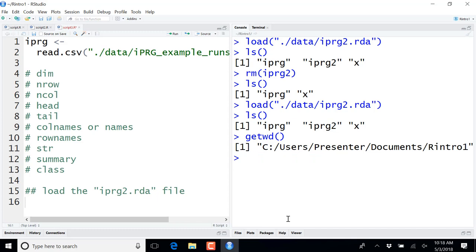So who knows what is stored in this IPRG2? Can anyone describe what I have in our IPRG2? Yes? I guess examples are mass spectrums. So like 12 is total, I guess 4, and each has like 3 replicas, for example. So that's a list of proteins that I guess is 2,000 or so rows long, and each sample or run has a measurement for each row. Yes. Absolutely.